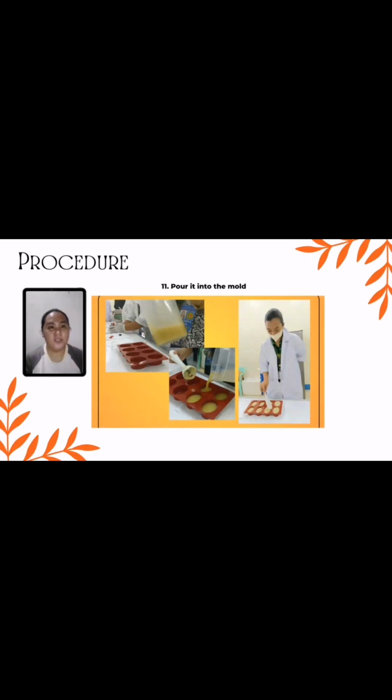Scrape the container using a plastic spatula to ensure no soap is left behind. Tap the molds on your table or counter to release any trapped air bubbles. After pouring into the molder, we scrape the top so it is even, and tap gently so the trapped air bubbles are released. Then insulate the molder by covering it with a sterilized cloth, the steamed cloth or towel.